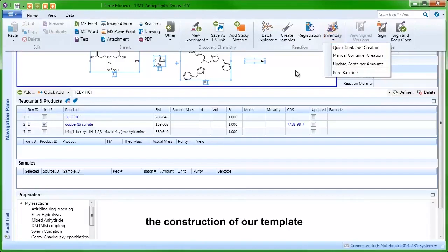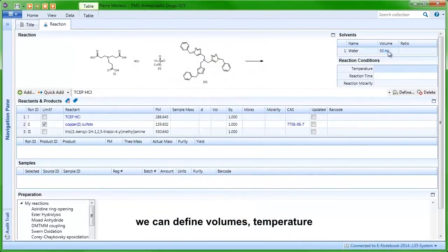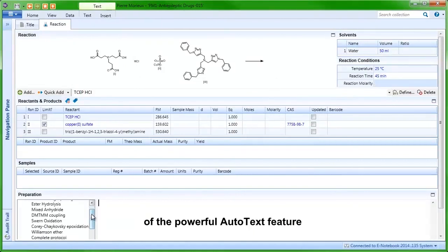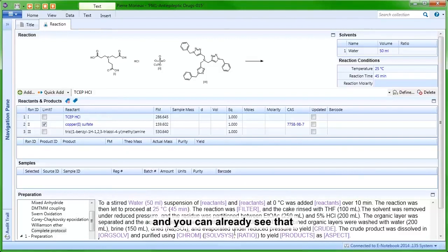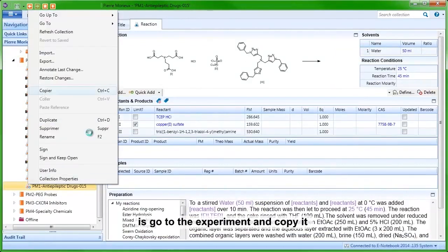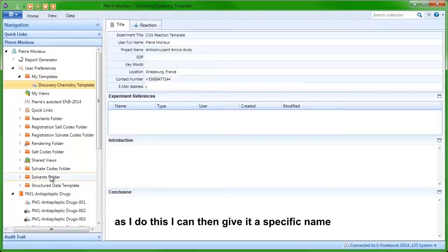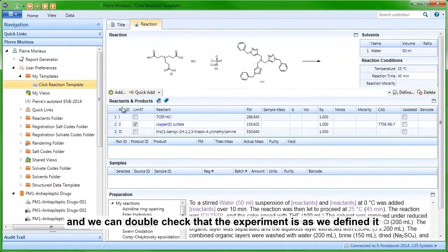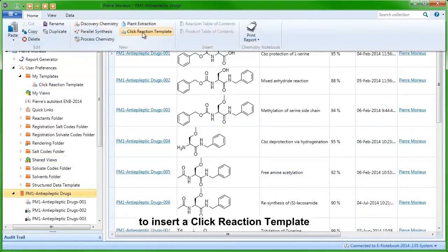Moving on with the construction of our template, we can add a predefined solvent — for example, by double-clicking and selecting water — and define volumes, temperature, as well as reaction times. For the text part, we can take advantage of the powerful autotext feature by double-clicking on the phrase 'Complete Protocol', which inserts a self-defined experimental procedure. You can already see that some of the dynamic fields in purple are already populated with the solvent and reaction conditions. From there, I simply go to the experiment, copy it, and paste it into the My Templates folder, give it a specific name such as 'Click Reaction Template', and verify that the experiment is as we defined it. Then, going to any chemistry notebook, I have the possibility to insert that click reaction template as a new experiment.